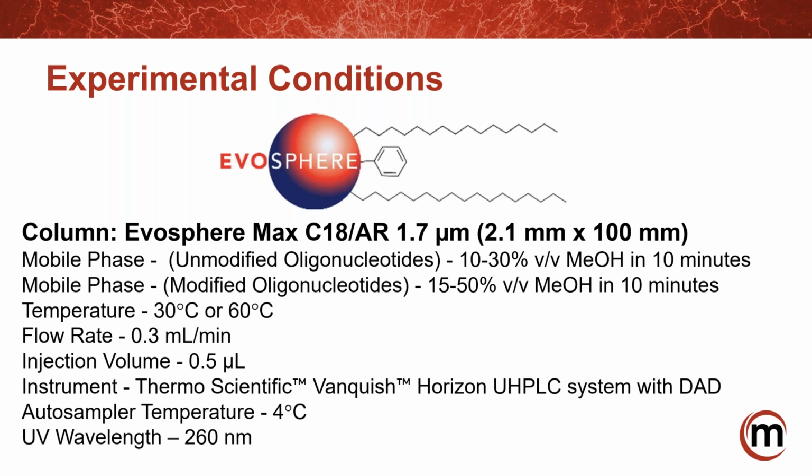We were at the HPLC meeting, and a company that focuses on oligonucleotides was doing preparative oligonucleotide separations. They had to use these ion pair methods on the preparative side, and they were destroying the column itself. The column lasted, I think they said, 10 or 15 injections. These are expensive columns, 30 millimeter ID columns can be pretty expensive.